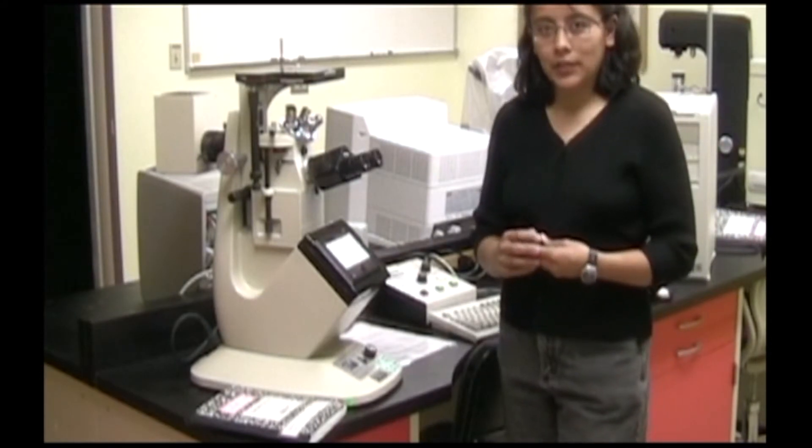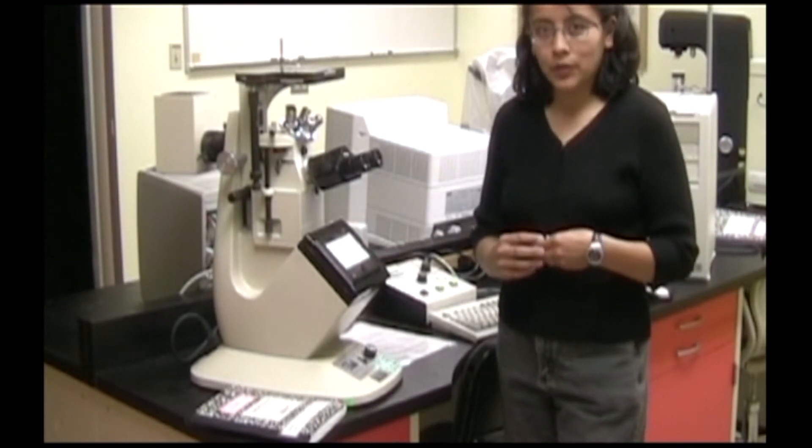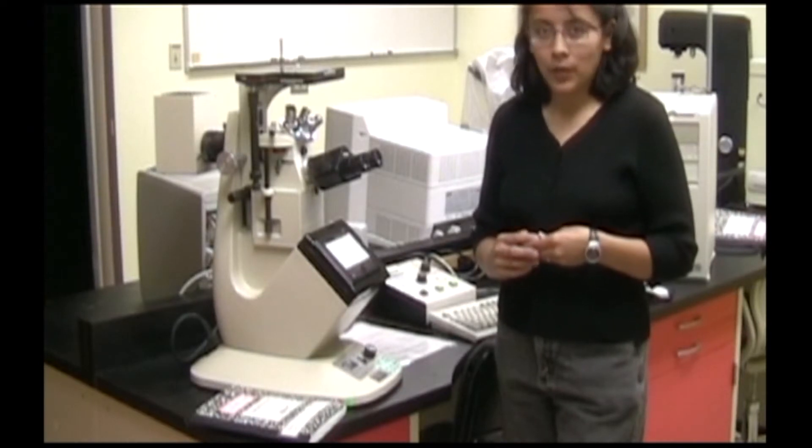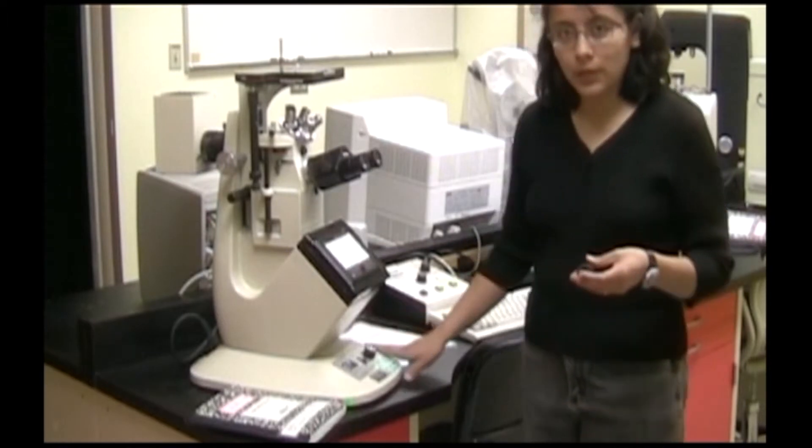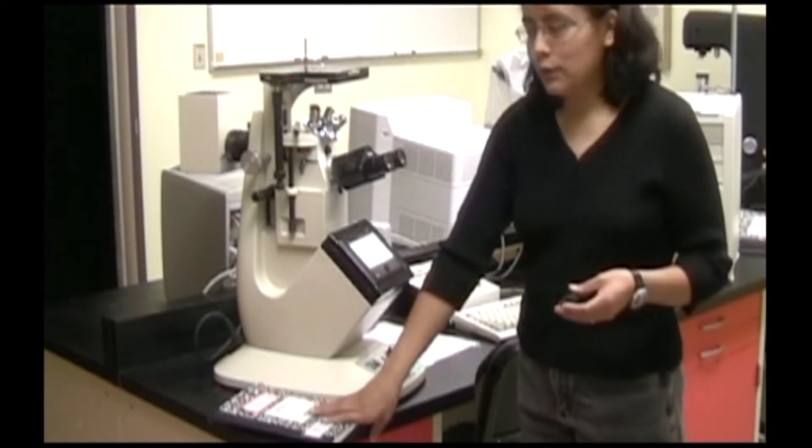During etching, you may need to look at your sample surface under a microscope to make sure that it isn't under-etched or over-etched. After you've etched, you may also want to take pictures of your sample surface. You should use the VersaMint tool for this. We sign in first.